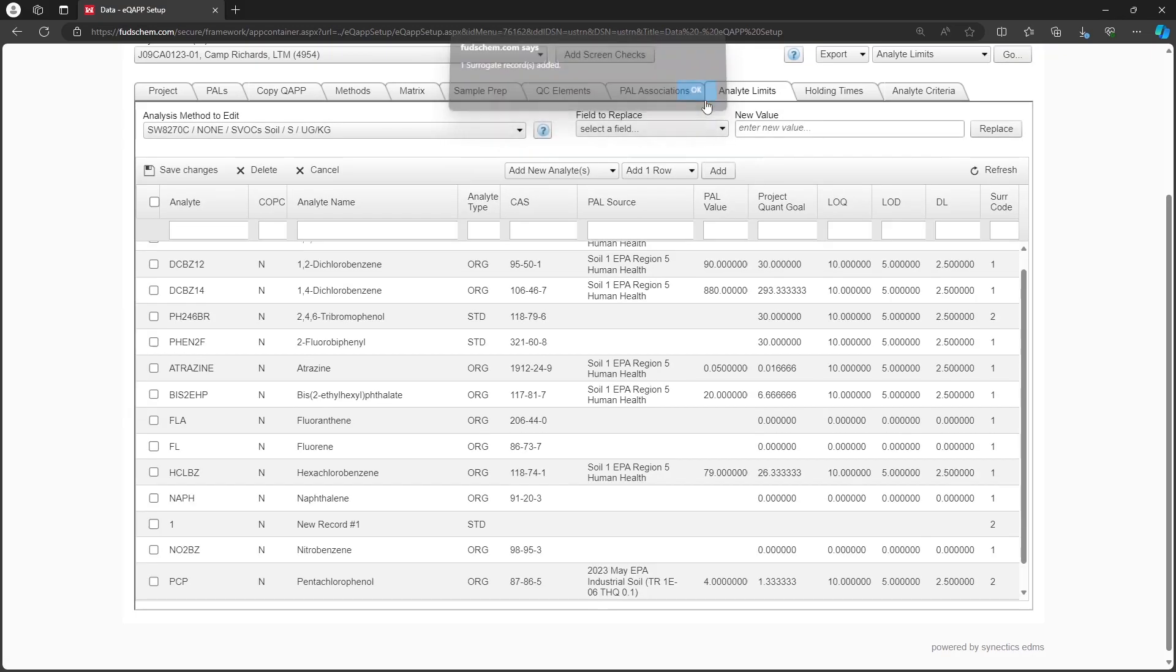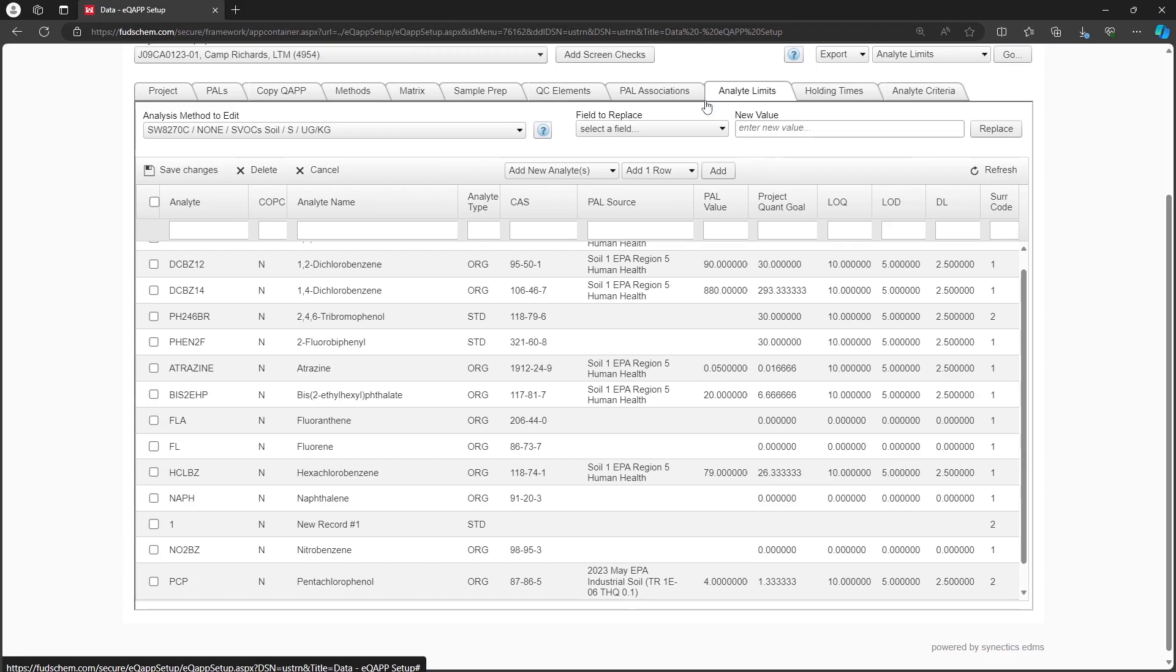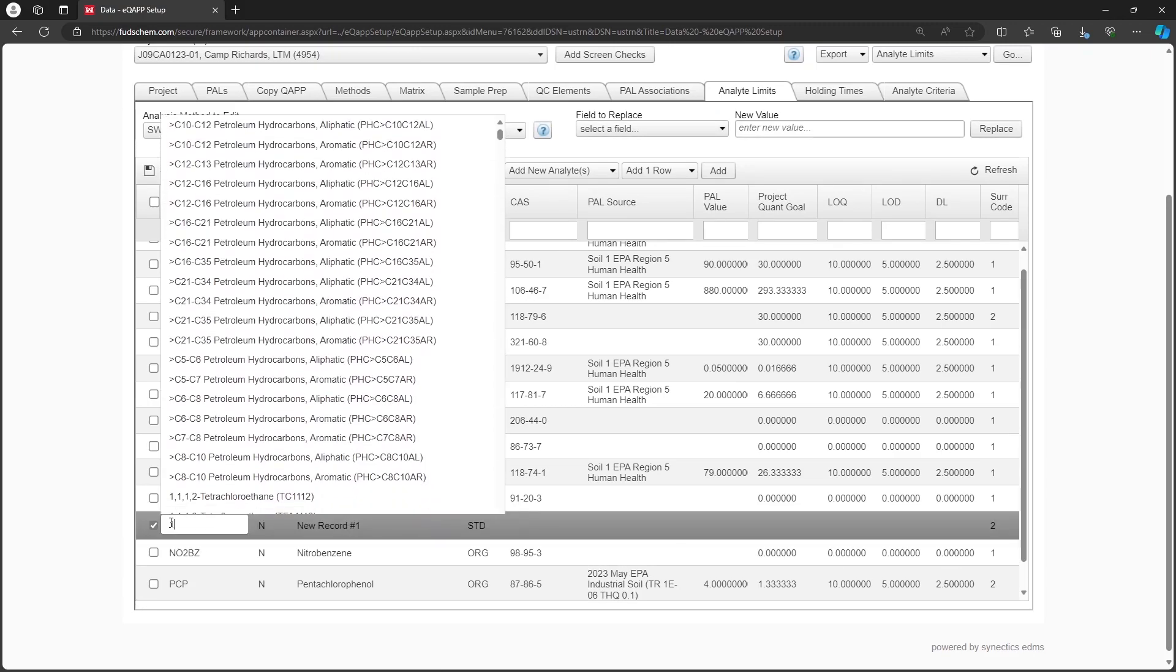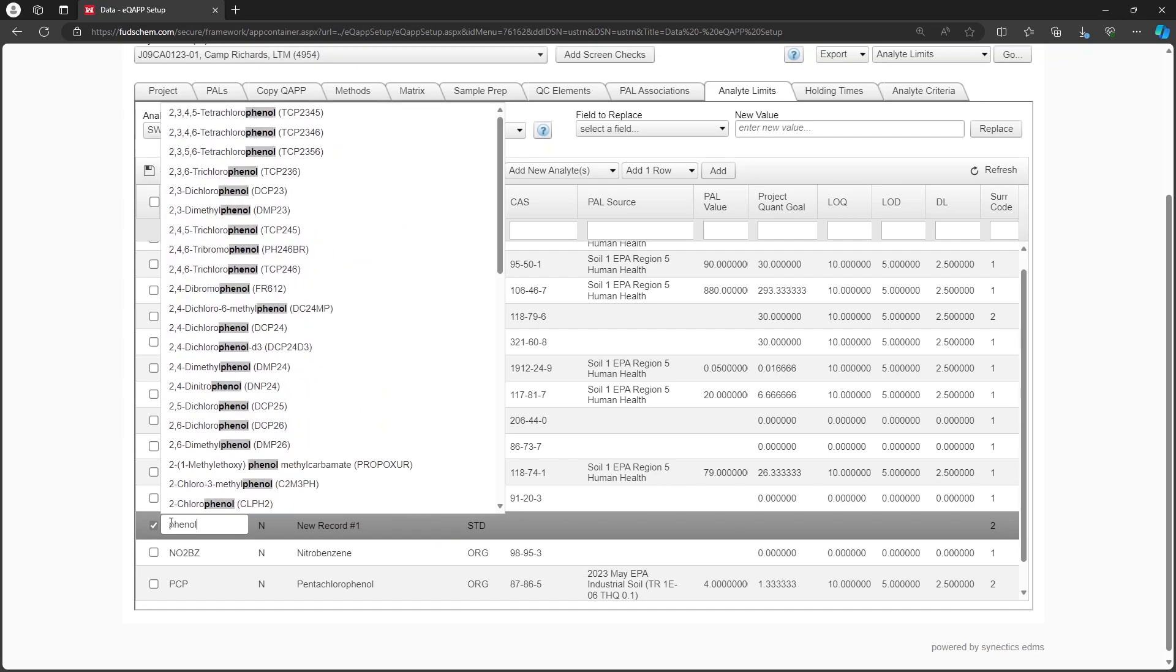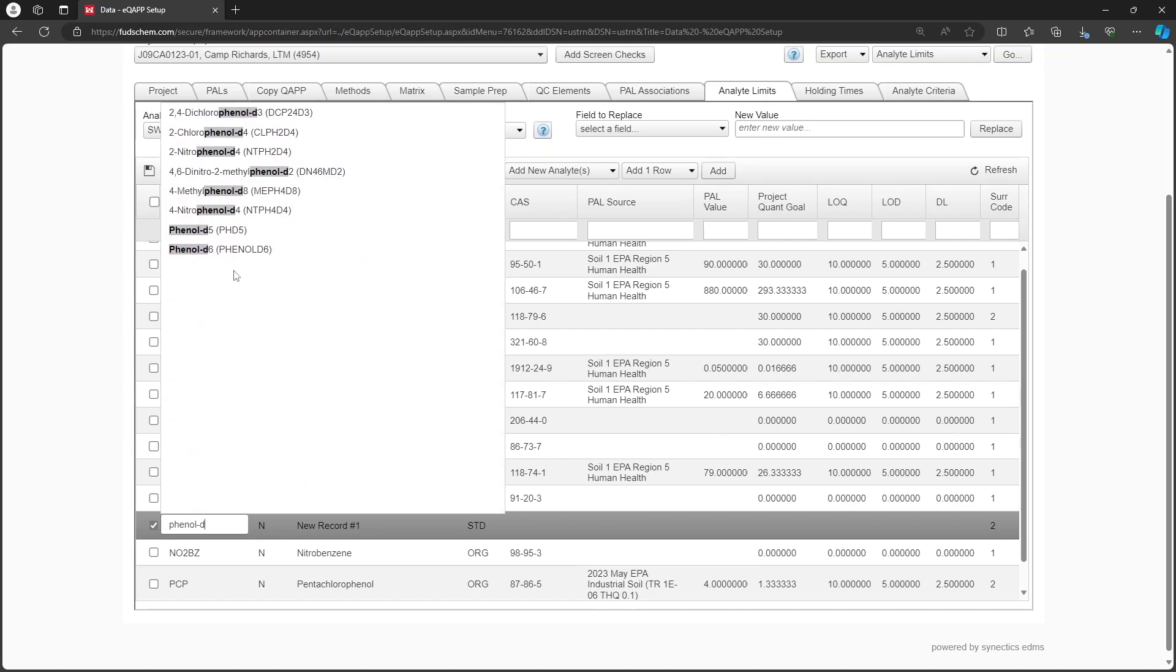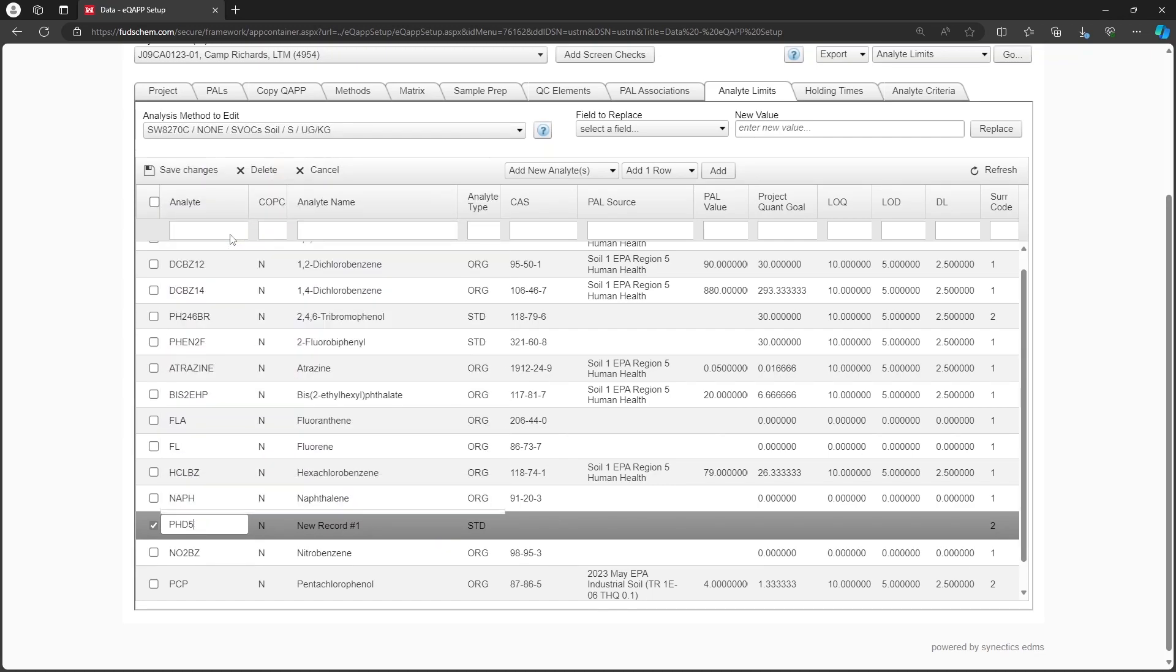Click Add. Like before, we will click on the number in the Analyte column and set our new surrogate. In this case, we will use Phenol D5. Then click Save Changes.